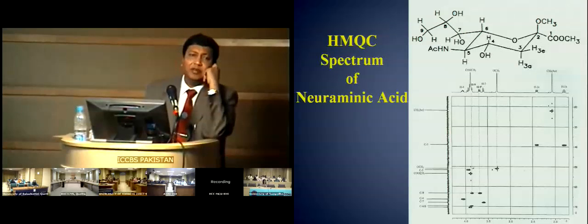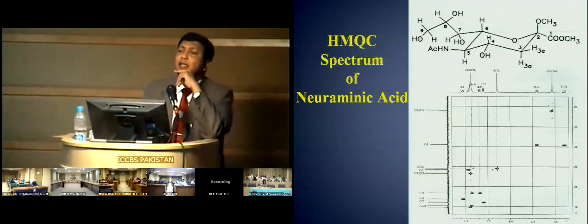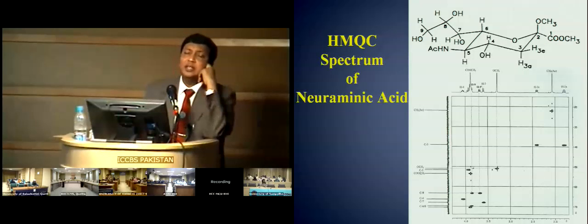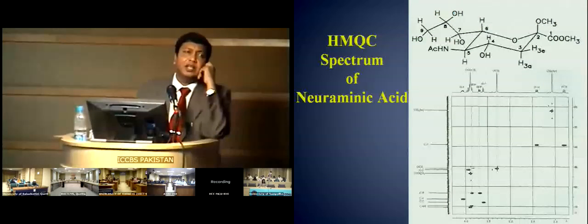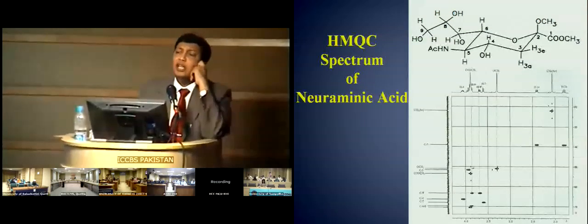There is a very slight difference in their pulse sequence. But they traditionally have been used by two different groups of people for two different types of heteronuclear interaction. Therefore, they are actually named differently.